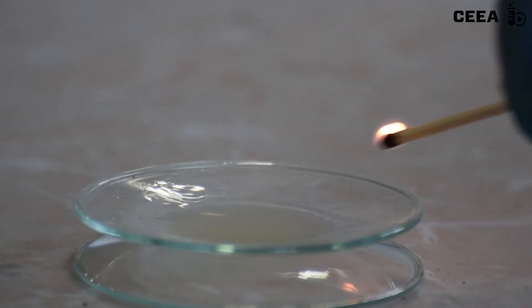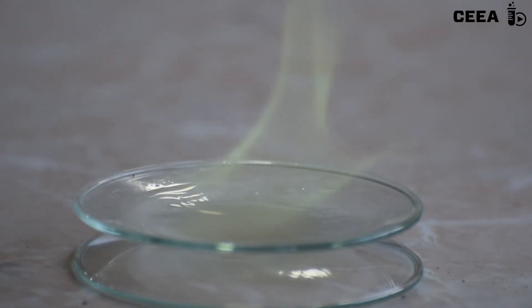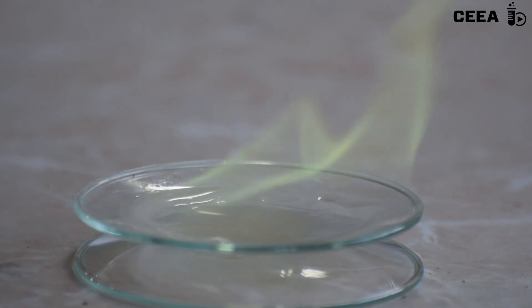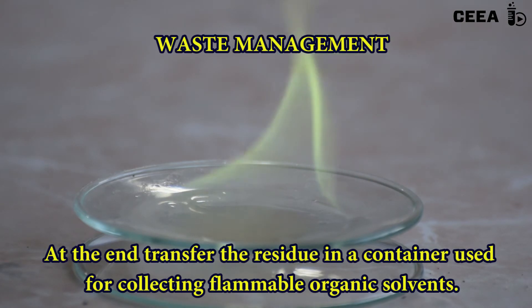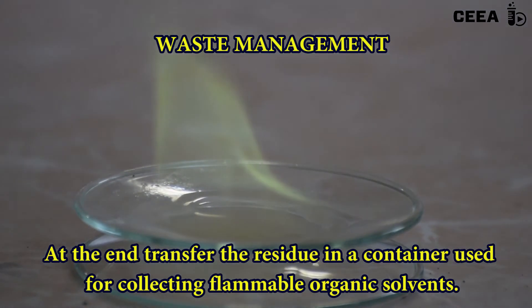Perform the reaction in a ventilated hood to avoid breathing the boric suspension. Discard safely of the remaining chemicals. The ester mixture has to be placed in a container for flammable solvents.